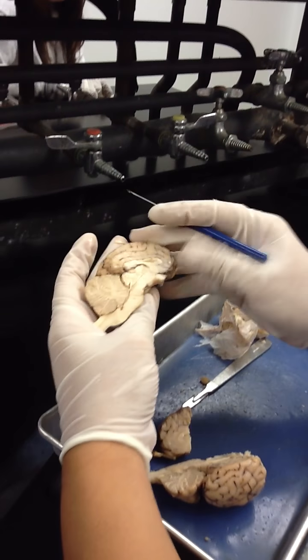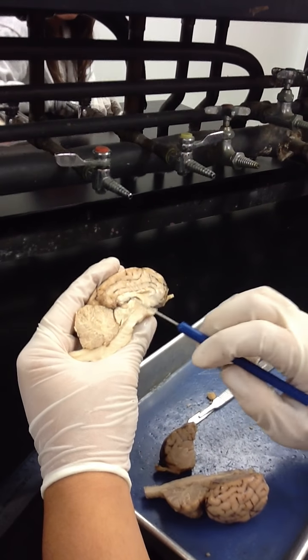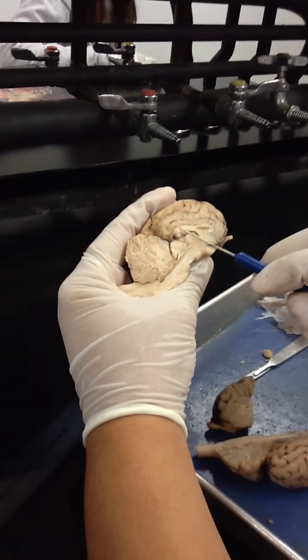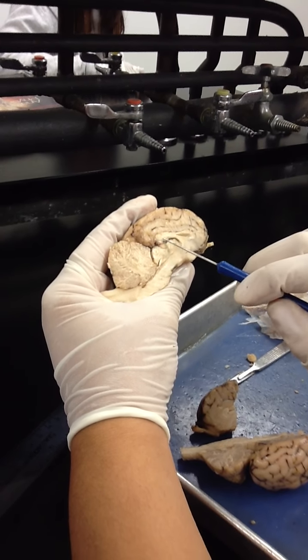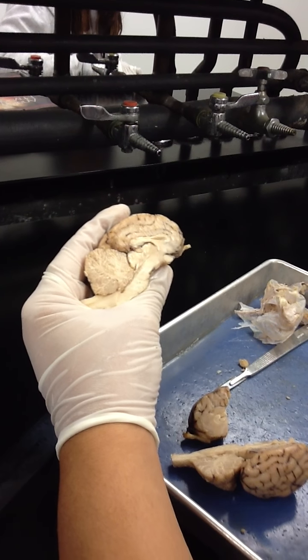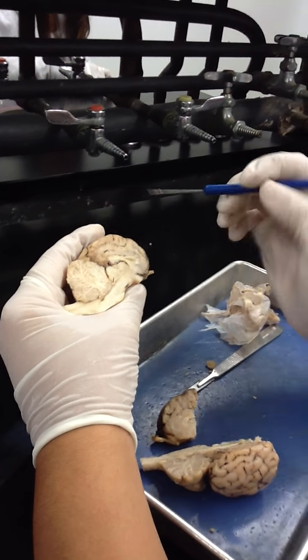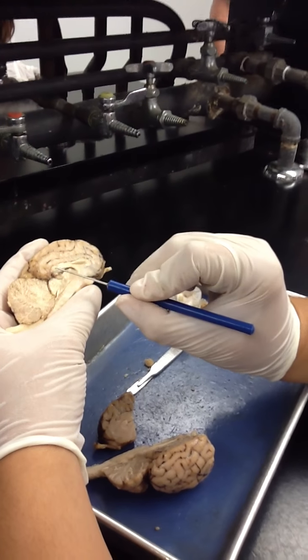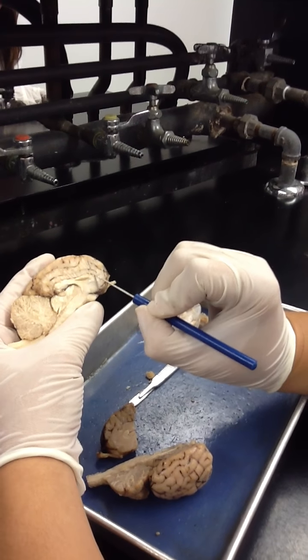Now here, so this is cerebellum, obviously. Right here, I want you to note an area of white matter. Do you see this? This is the corpus callosum. The corpus callosum is the only white matter that communicates between the left brain and the right brain. Okay, that's the corpus callosum, right there.